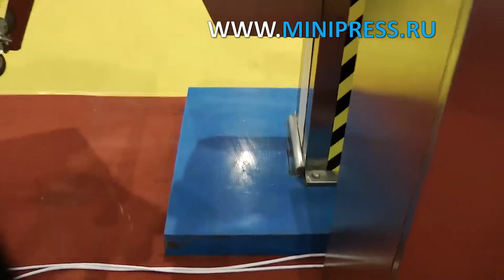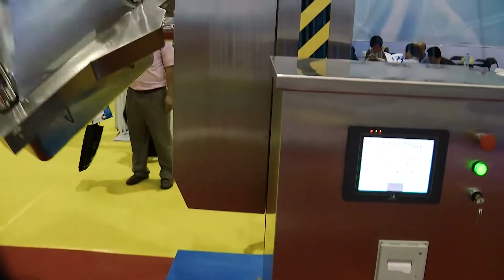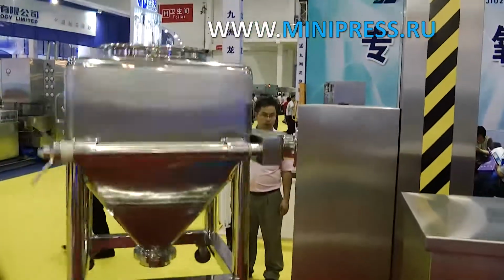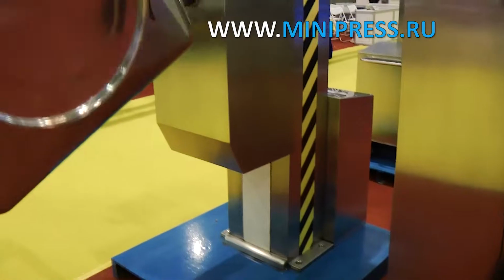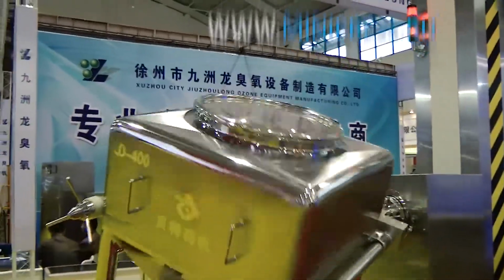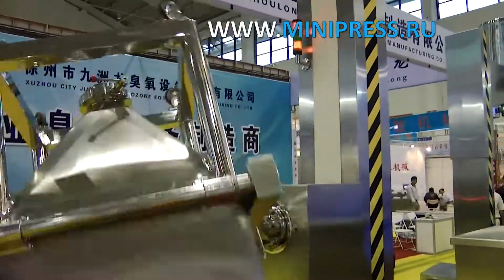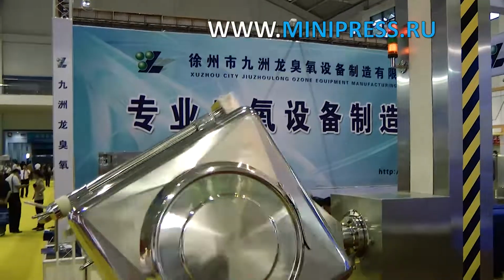Geography of manufacturers has expanded, competition has increased, and this in turn has affected the quality of the equipment produced. In pharmaceutical production, it is very important to control the quality of raw materials and finished drugs. In production, they check the moisture level, melting time, transparency, decomposition and dissolution time, quantitative composition, melting, hardness parameters.